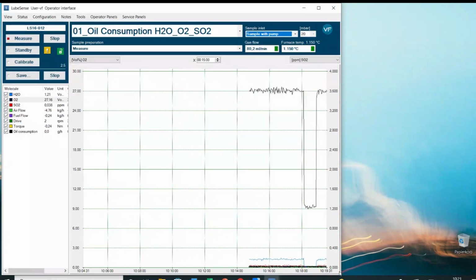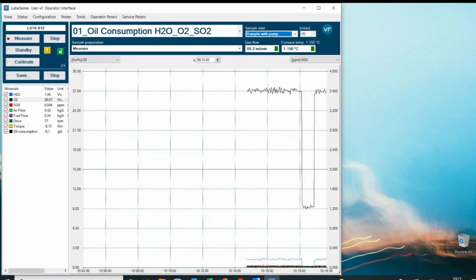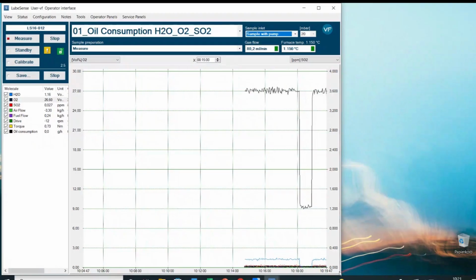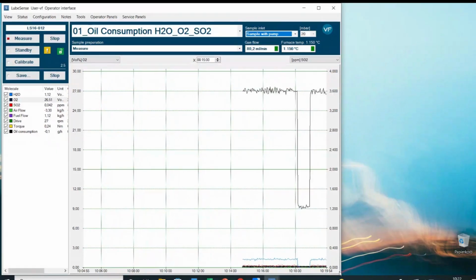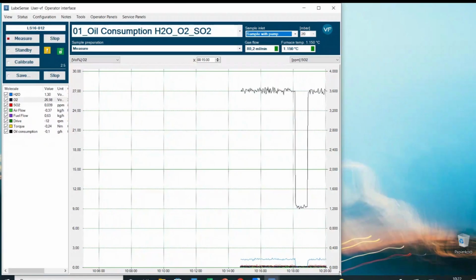So when I open the inert port, we see here there is nitrogen connected. So what will happen is the nitrogen valve will open and then supply the gas to this line here, which is connected to HPT. So the gas will flow in this direction. And once we follow that line, so I will just show it briefly, it's going down here and then will come back up here. So here the nitrogen will flow past this T-piece. So the instrument will just draw the nitrogen throughout the complete system. I'm sorry, now I've just messed it up.